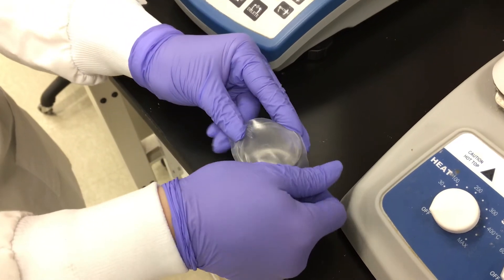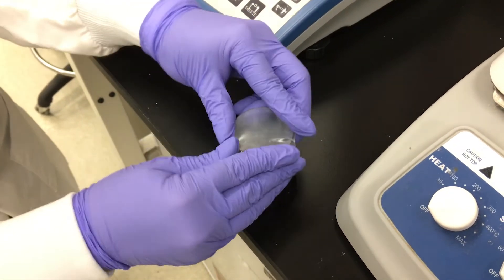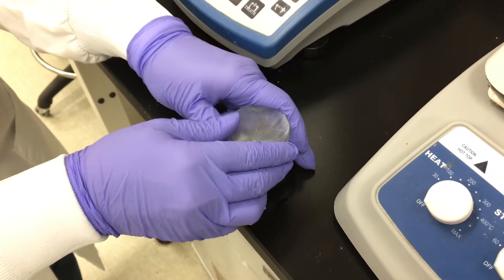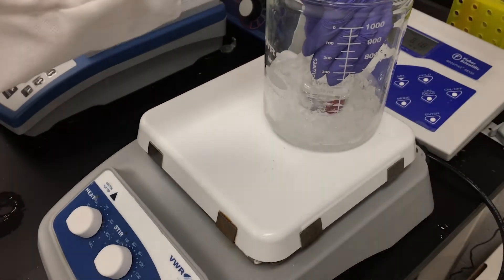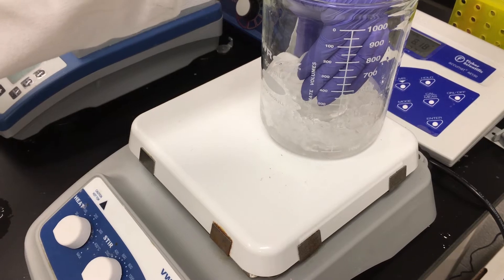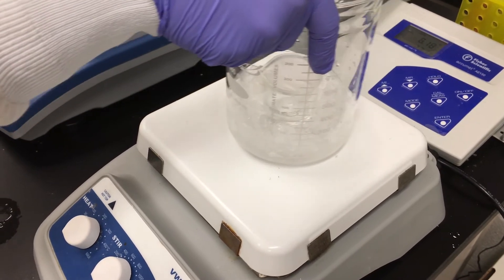Cover your solution and place it into an ice bath on a magnetic stirring plate. Gently stir the solution until the sodium borohydride is completely dissolved.